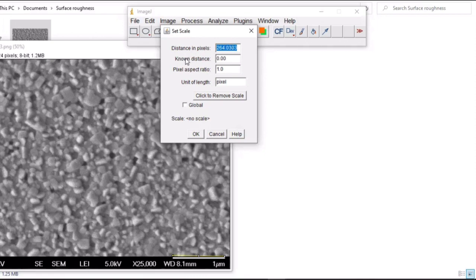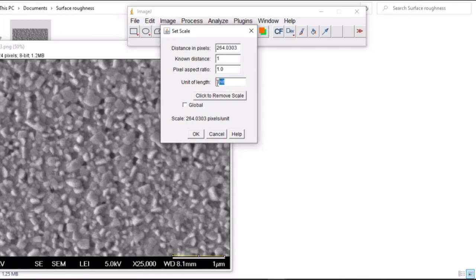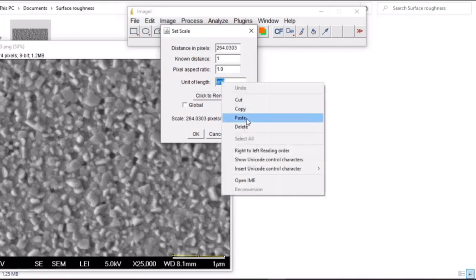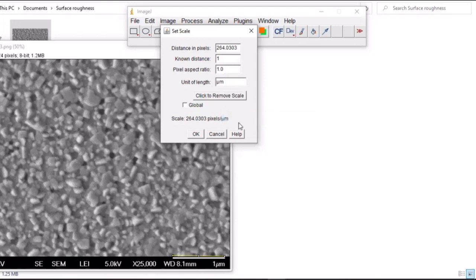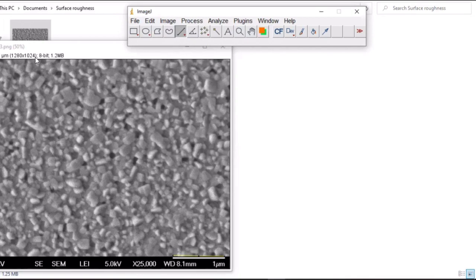The known distance is one micrometer, so you write one. Then this is constant units of length. The unit that we are having here is in micrometer. If it is in nanometer, you need to write it here. Click OK. You observe the changes.